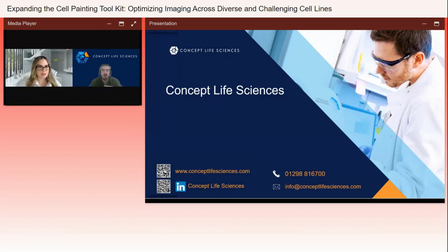And then when you've got a known mechanism of action of a reference compound, the idea should be that a similar phenotype would come and cluster together in the PCA analysis in a similar place to the unknown compounds and inform potential biological outcomes. And obviously, you'd require a large amount of data to do this. And I was just presenting a small proof of concept here. So I wasn't able to dive too much into that, but it is possible.